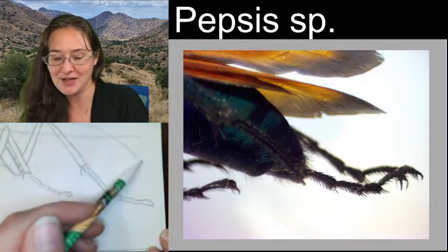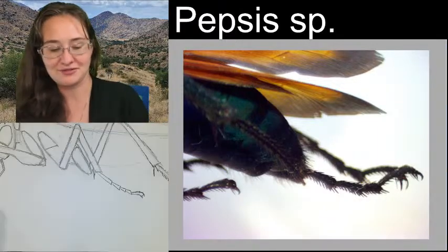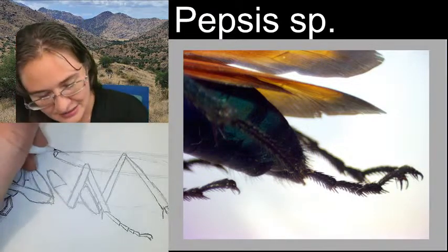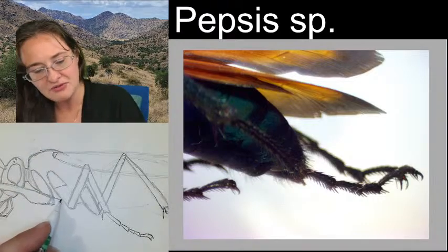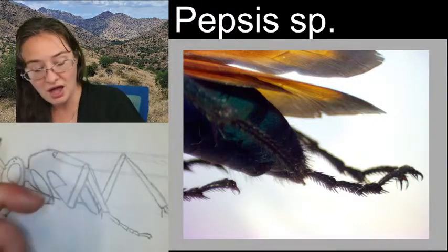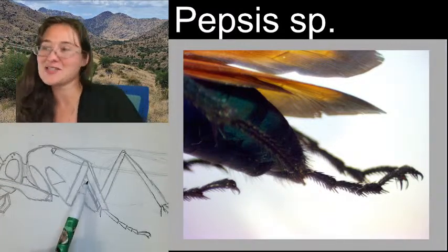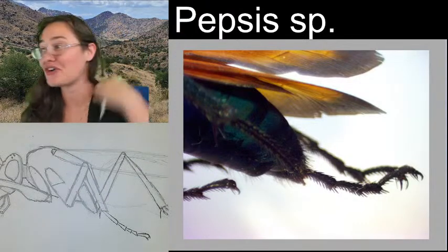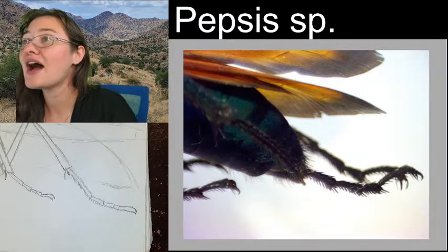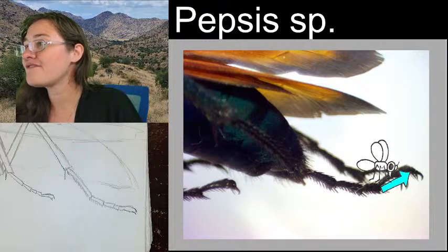I'm erasing Pepsis because I would much rather have the sketch of my wasp than the words. I'll put the words somewhere else. All right. So I have a head. I have leg segments happening. I have most of a thorax kind of taken care of. I need to kind of connect some of these lines underneath, connect the coxal plates. I'm coming back in and adding the edge of our middle body segment. I want to call it the thorax, but it actually includes one segment of the abdomen. I'm going to call it the thorax from now on. How many tarsi? Five tarsi. So we can see them. This one is 1, 2, 3, 4, and then 5 right here.